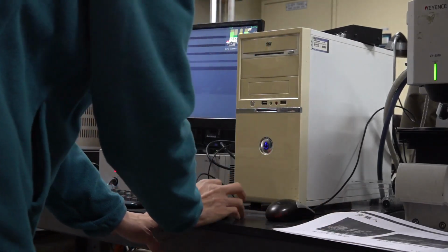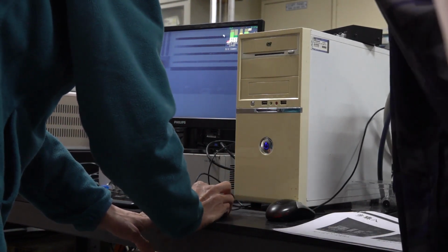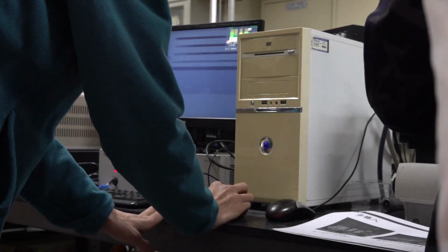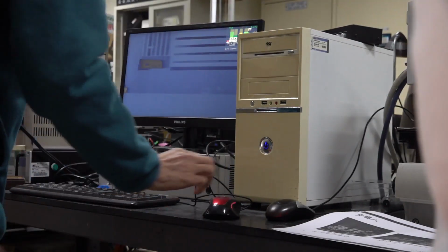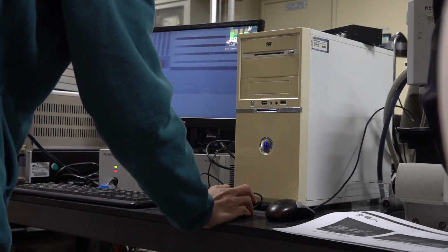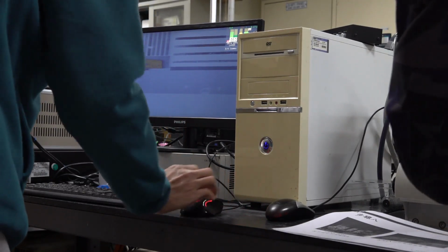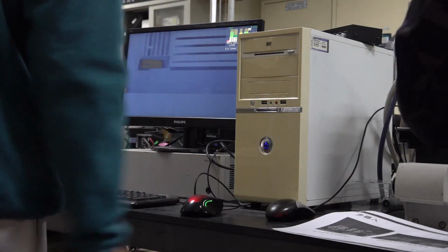RTN. RTN is over here. Okay, now we have trouble finding the RTN.